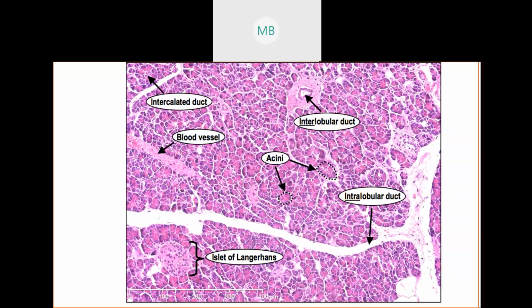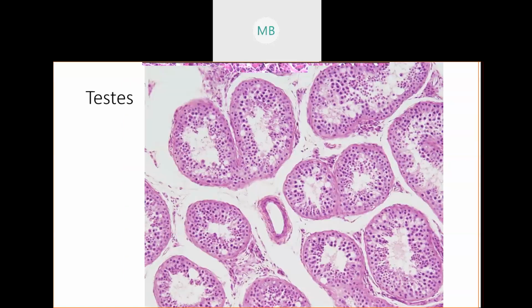On the flip side of that, you can see these circles, or these lighter pink nodes, for lack of a better word, within your pancreas. You have 2 potential names of those little nodes. They are either called your pancreatic islets, or they are called your islet of Langerhans. Once again, with the angry German, it makes it easier to remember and more fun to say. Your islet of Langerhans here are the parts of your pancreas that work with your endocrine system. So they are the parts that make your hormones that we're worried about. Right?